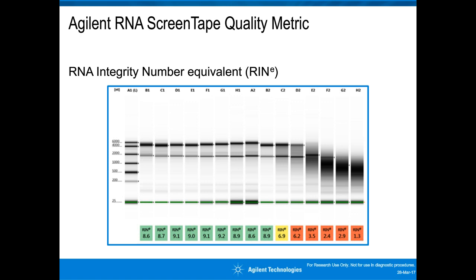The example shows different stages of RNA sample degradation. The RNA integrity number algorithm analyzes the number of peaks and peak shape in the electropherogram and automatically calculates the RINe. It ranges from 1 to 10, where 10 reflects the most intact RNA. The RINe is provided for eukaryotic as well as prokaryotic RNA samples.